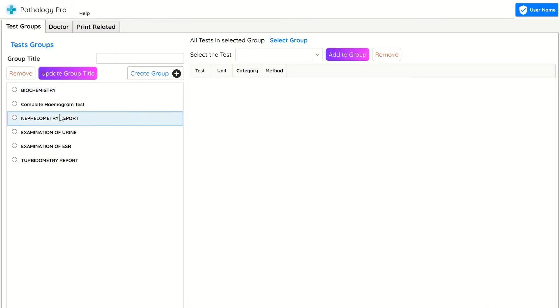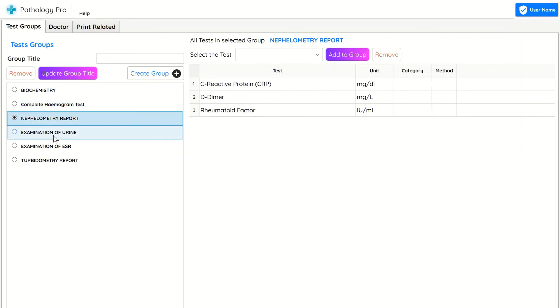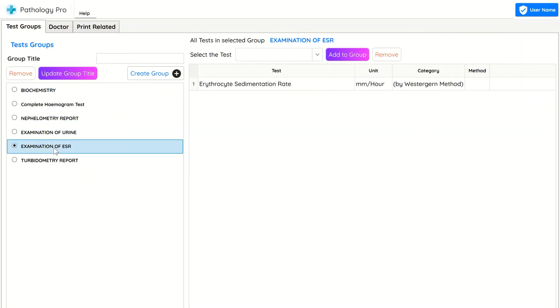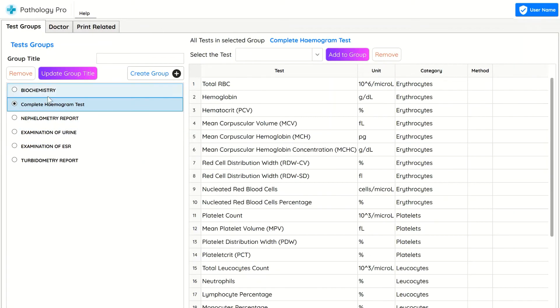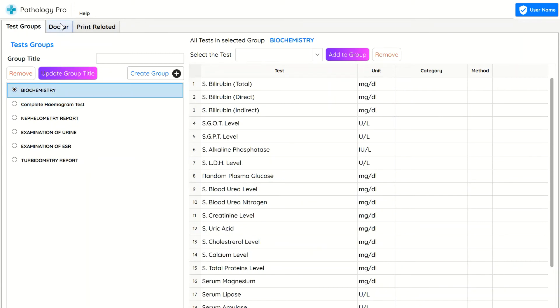In Test group window, you can group multiple tests which will save your time while adding the tests while creating reports.